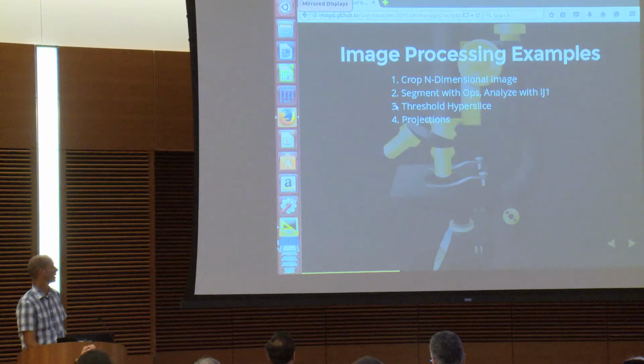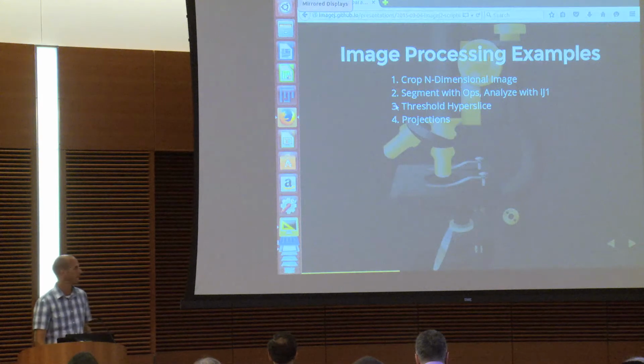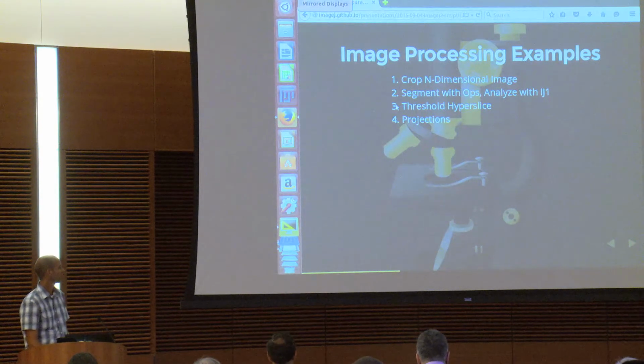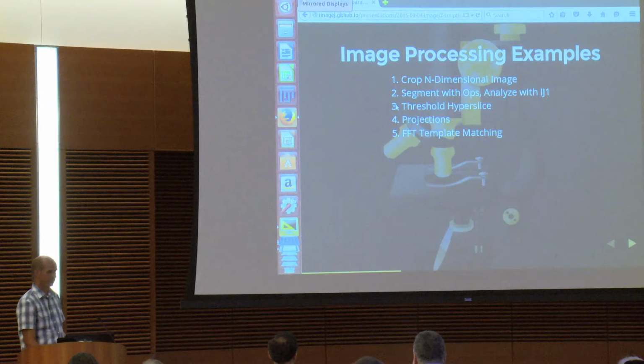Then we're going to look at projections. And this was actually a listserv question, so that's kind of cool. It was driven by the community. And then if we have time, we're going to look at an FFT template matching example.